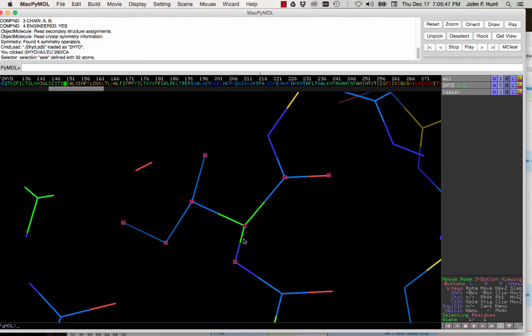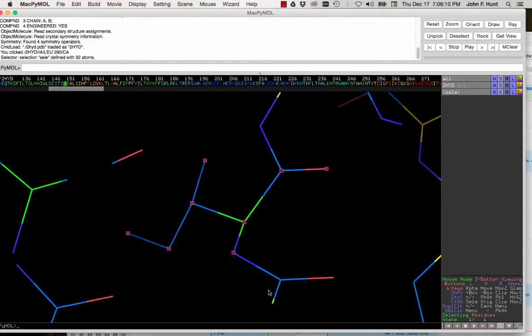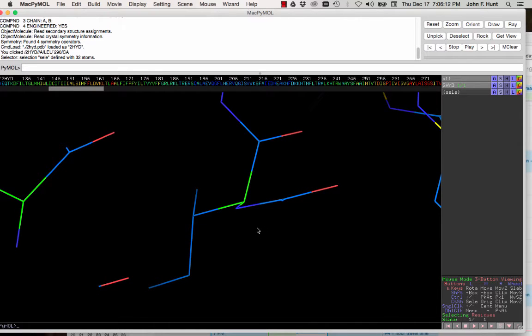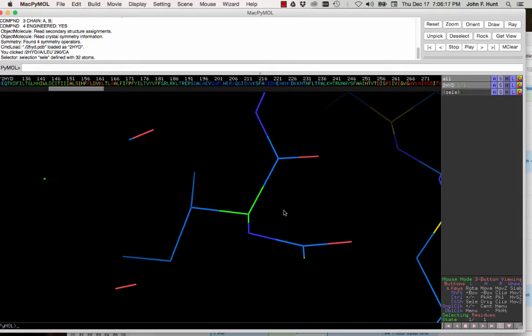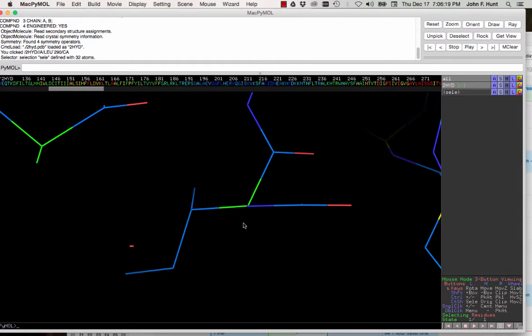And so if the NH is pointing horizontally to the left, 0 of phi would be C alpha C pointing horizontally to the right. Now, however, because we cannot see the NH directly, we want to use the N C(i-1) bond, because that's coplanar with the NH. We will put that horizontally to the right. And so when we do this, here we go.